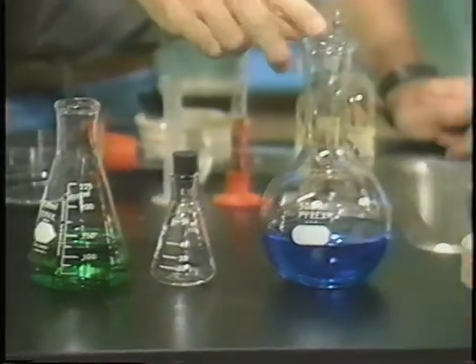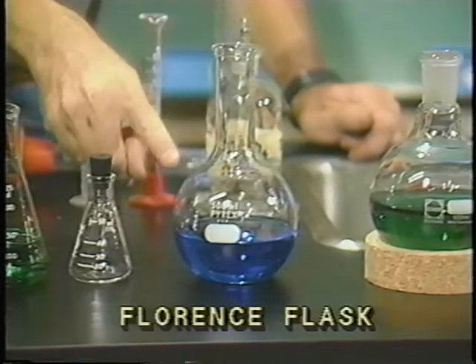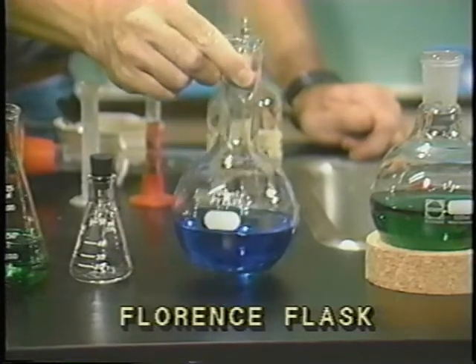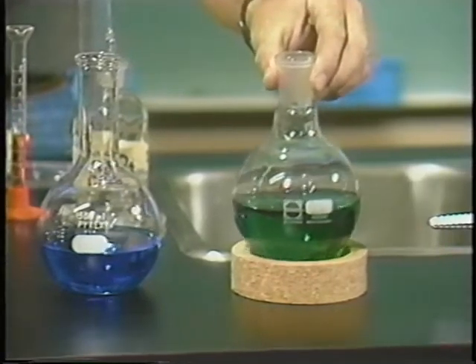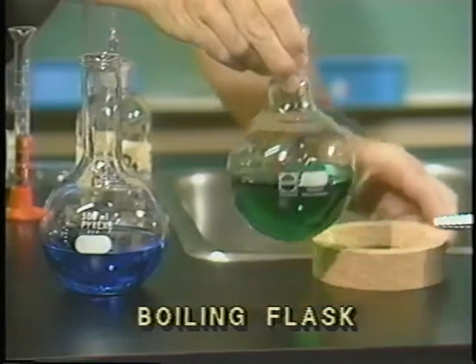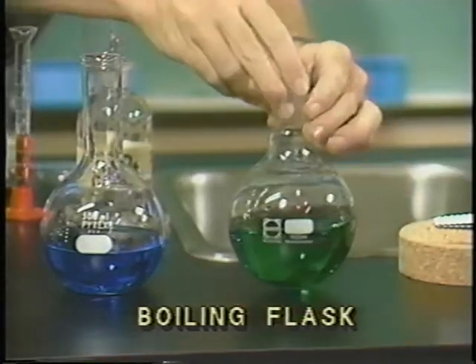Next to that, we have what's called a Florence flask. This Florence flask has a long neck and a round shape to it. And this particular one has a flat bottom, so it'll stand by itself. If you have a flask that looks like a Florence flask but has a smaller neck, we call it a boiling flask. And this particular boiling flask doesn't have a flat bottom, so it has to be supported by something or held up with a clamp.